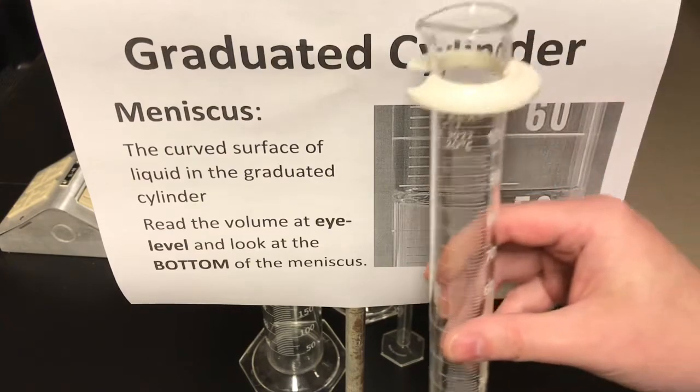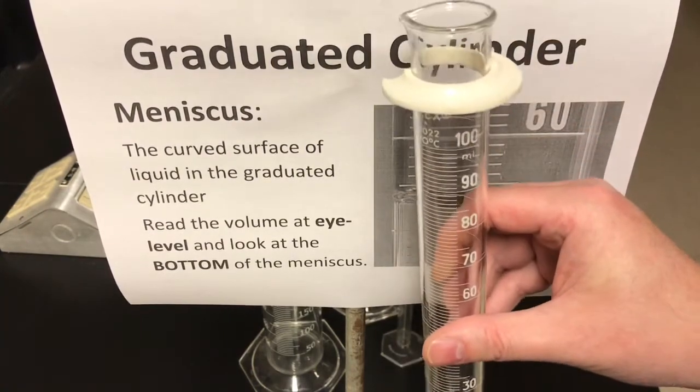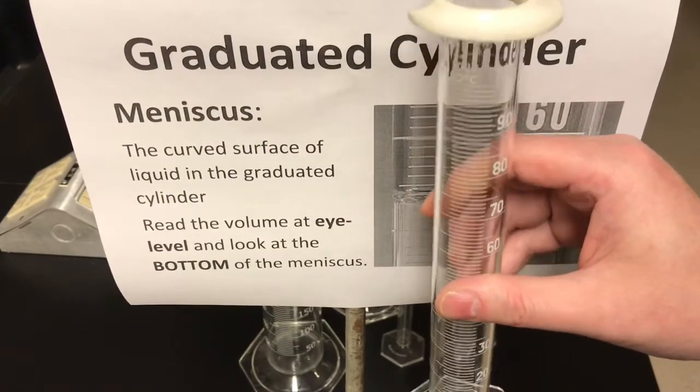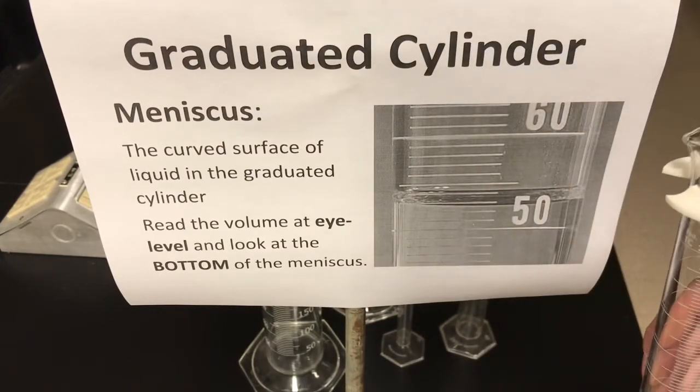When you look at a graduated cylinder — here's one in my hand — you can see why it's called a cylinder. It's got a circular top and bottom, and when it holds a liquid, the liquid will be in the shape of a cylinder. But why is it called a graduated cylinder?